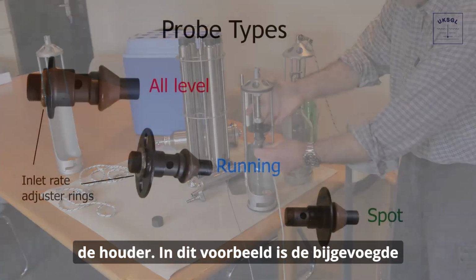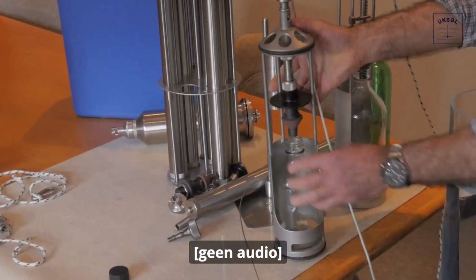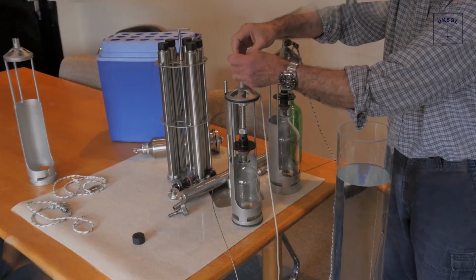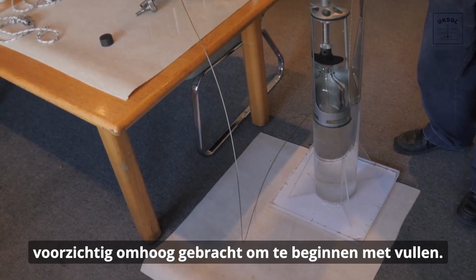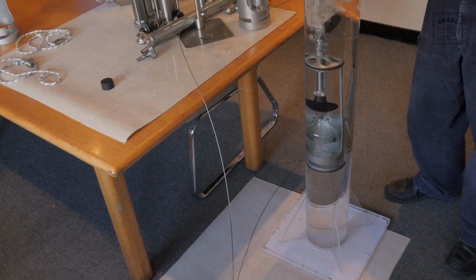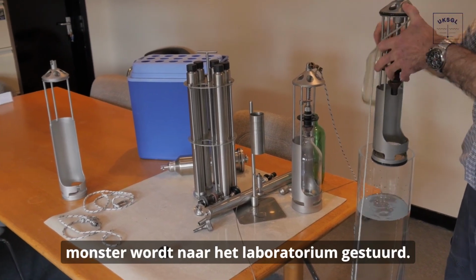In this example, the attached probe is for spot sampling. It is lowered into the liquid, then gently raised to begin filling. As with the 2-inch tubes, sharp jerks must be avoided, as this will cause the valve to close. Upon retrieval, the probe is removed, the bottle is capped, and the sample is sent off to the lab.